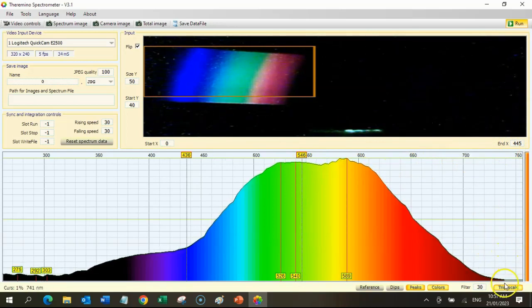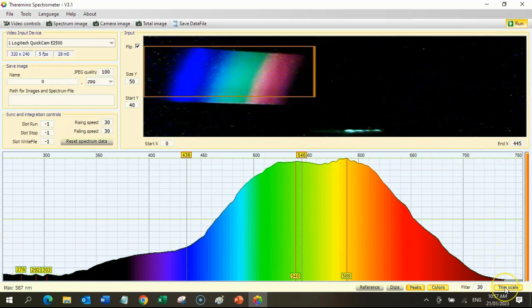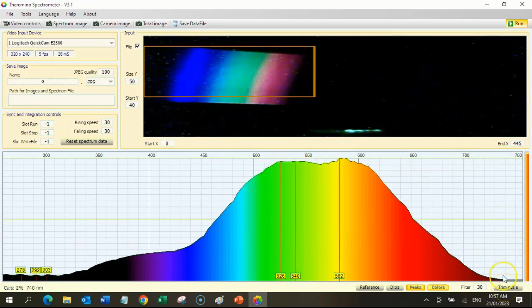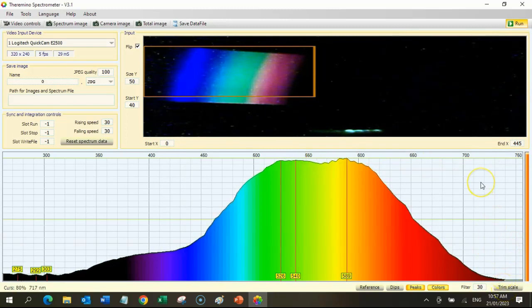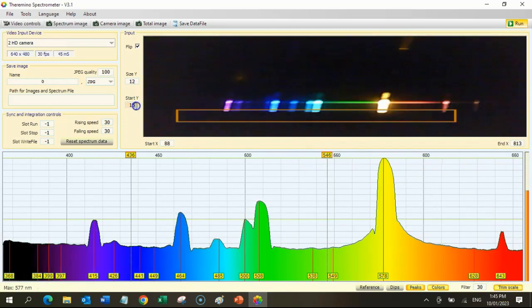Once calibrated, you can press the trim scale button again to turn it off.